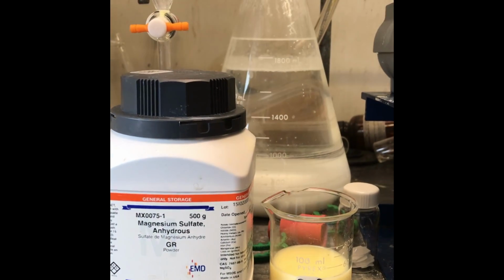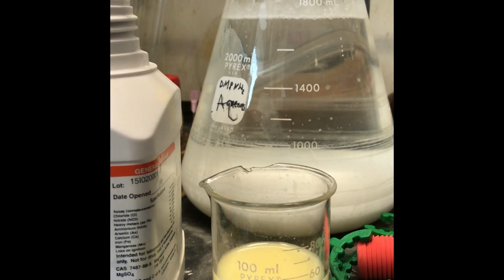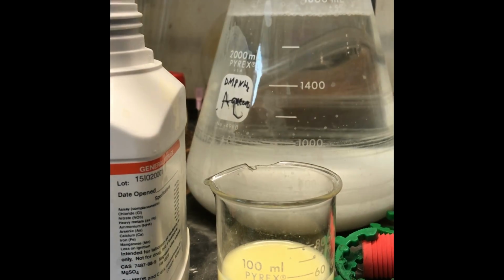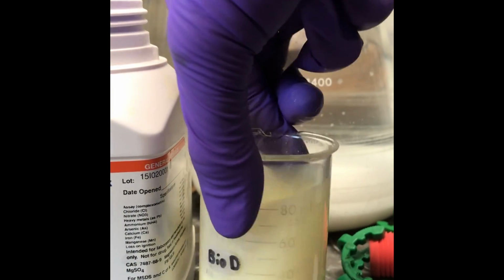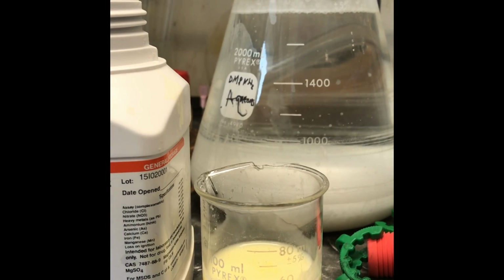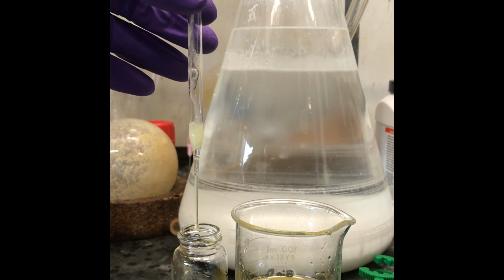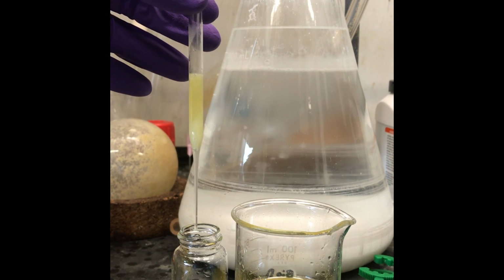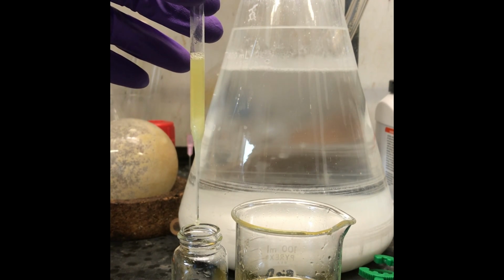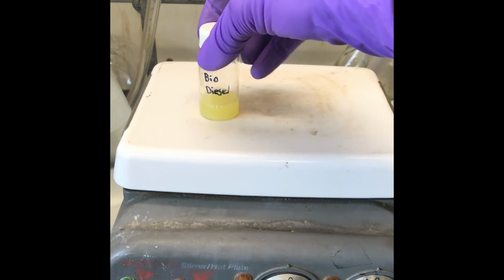And the remaining biodiesel product is dried of any remaining water using anhydrous magnesium sulfate. The magnesium sulfate is added and allowed to sit for a few minutes to soak up any remaining moisture. The biodiesel is then run through a filter pipette to separate any magnesium sulfate and obtain pure biodiesel. The end result is pure, usable biodiesel.